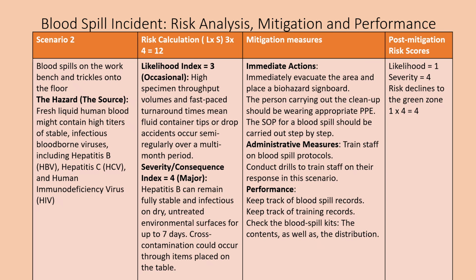Mitigation measures. Immediately evacuate the area and place a biohazard signboard at that site. The person carrying out the cleanup should be wearing appropriate personal protective equipment. The SOP for a blood spill should be carried out step by step.